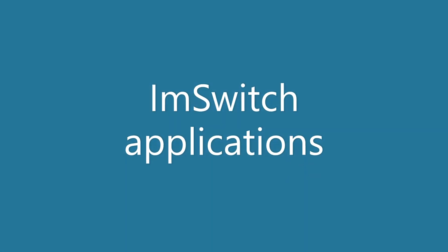So I hope that you followed and you found useful the workshop and the first part, at least, where I introduced the material. I also guided you through the architecture and how to develop devices and widgets, and then how to make use of the interaction between ImSwitch and Napari, and a brief introduction to the scripting. And now I will leave you with Jacopo, Jonathan, and Benedict that will share their experience and developments.